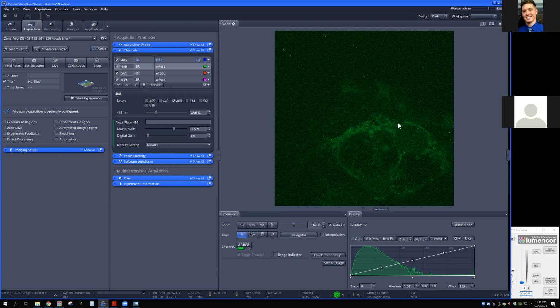Instead of getting rid of those extra orders of information, you're actually keeping them, collecting those extra orders and using them in processing. Exactly. Plus we get the signal from the entire peak and more. So for all of those reasons, mathematically, you can reassign. And considering that deconvolution works best when you have a lot of signal, it's just so much easier.